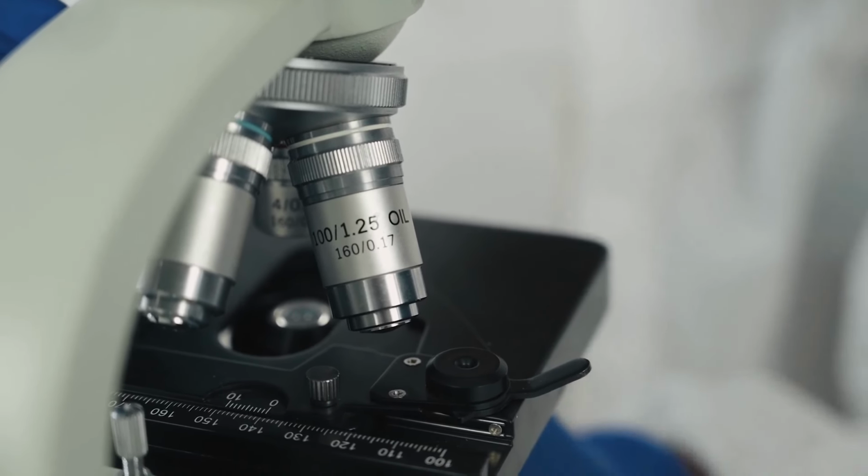First, the simple microscope. It's basically a strong magnifying glass, one lens to make things bigger. Great for details on a flower petal or the fuzzy legs of a beetle. Next, the compound microscope. Compound means multiple lenses, an eyepiece and objective lenses working together. Together, they can magnify hundreds of times. This is what we use to see bacteria, blood cells, and tiny pond creatures.